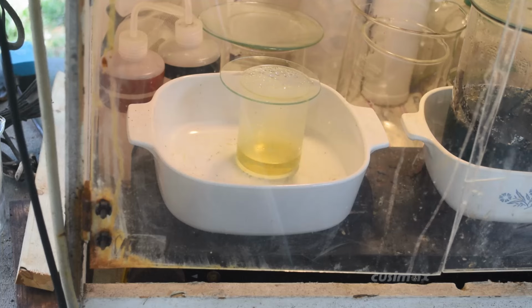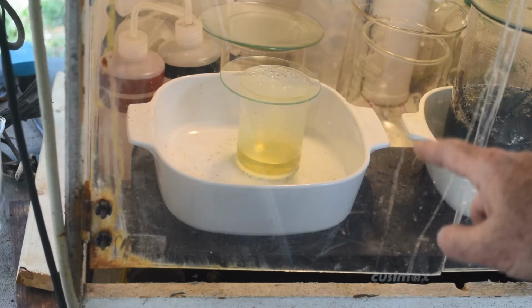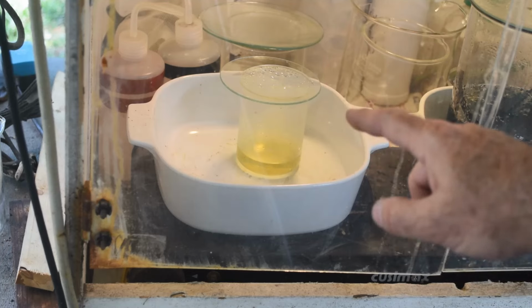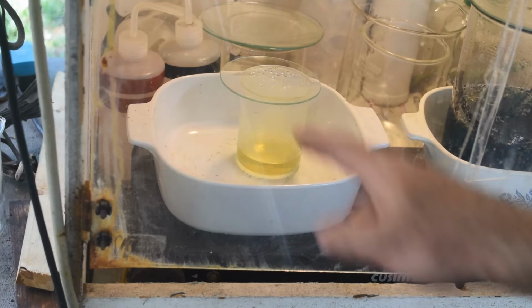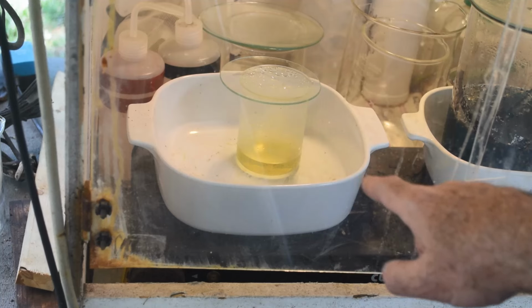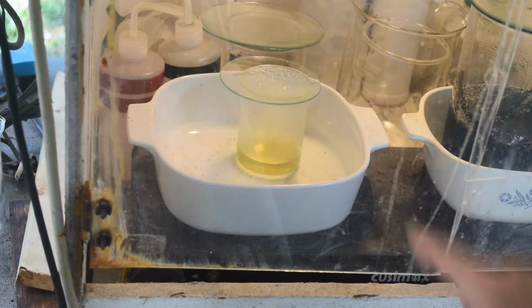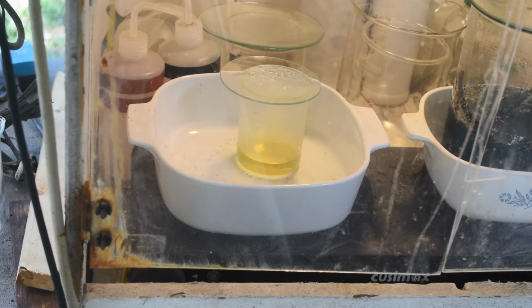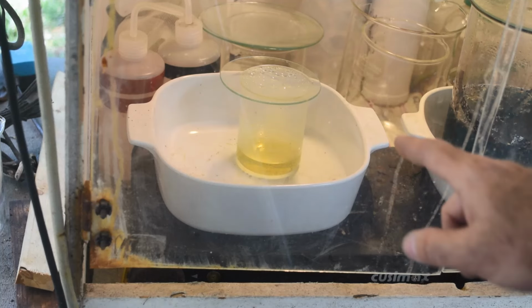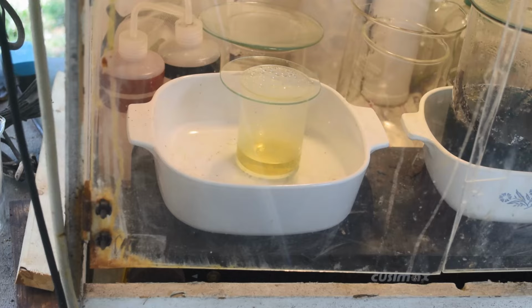Alrighty, it's been maybe a half hour, and I'm liking the color on that. That is the color of precious metal in solution. Doesn't mean that's what it is, that's just the color of it. Most of the solids I put in there have gone into solution. There is a little bit of black scum in there that hasn't, but a lot of that metal has dissolved in the dilute nitric acid solution there. So I think it's about time to pull that out and do a stannous chloride test on it and see.